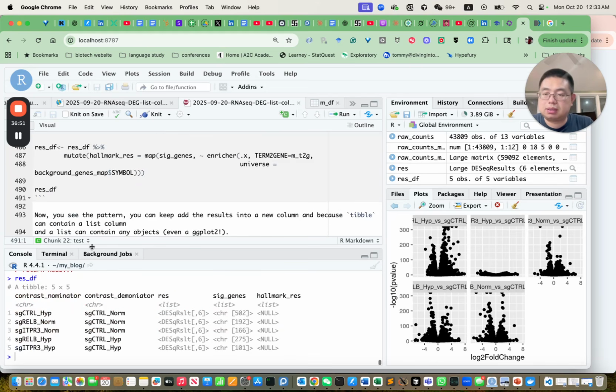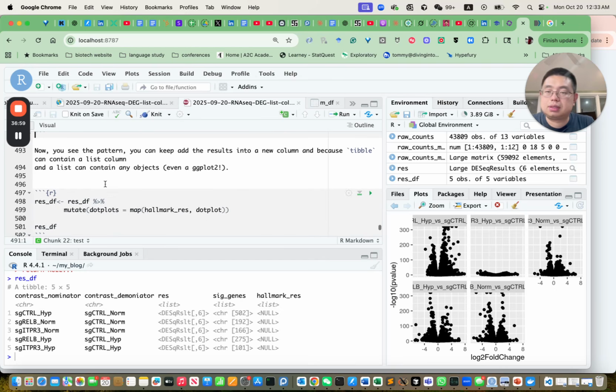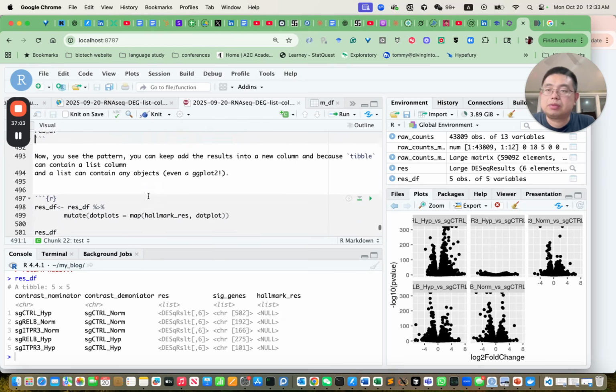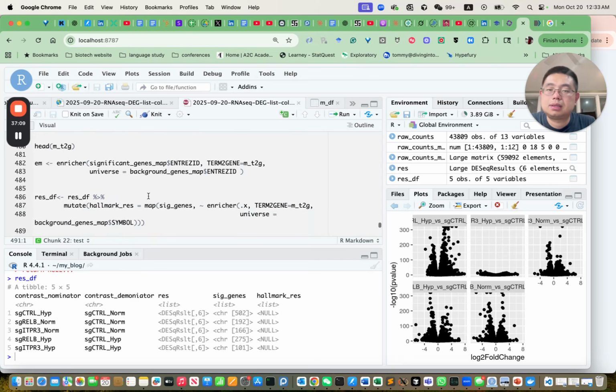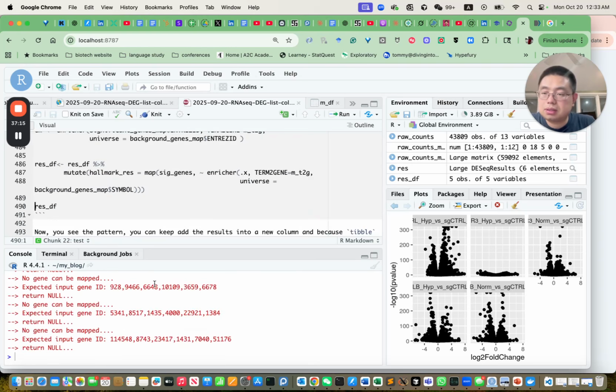And if you take a look, okay, let's see, it says something is wrong here. Let's see. Okay, let's redo it.